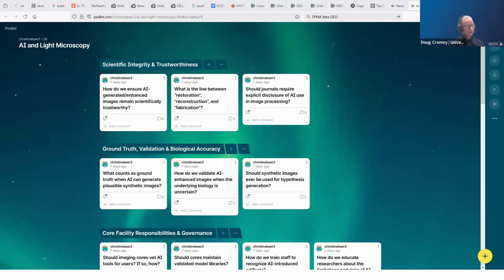We were having a discussion before we came on about the fact that at least at the moment, the proprietary image file formats, where we bang our heads against the wall because ND2 doesn't talk to CZI, doesn't talk to LIF, may actually help us in the short run until AI figures out how to write to those obscure formats. Just because then we have, in a sense, our original data, but how long that will last is a little hard to tell. Well, the way that AI can code, it's not going to last very long.